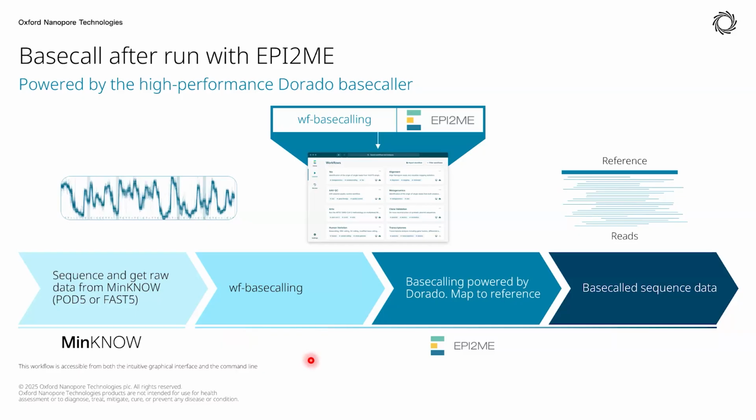This one has the added complication of making your NVIDIA GPU available through Docker or Apptainer, which sometimes can be more straightforward, but other times can be a little bit more difficult depending on your expertise with your OS and the software.